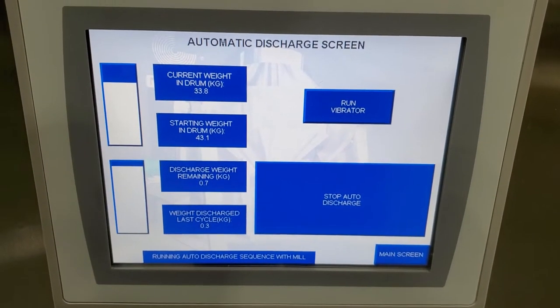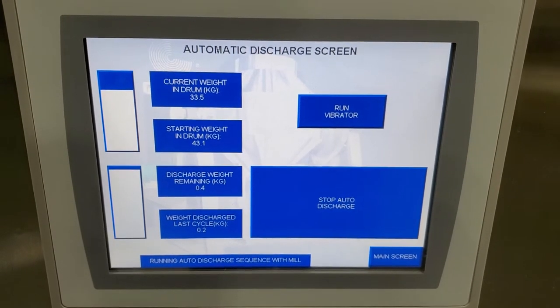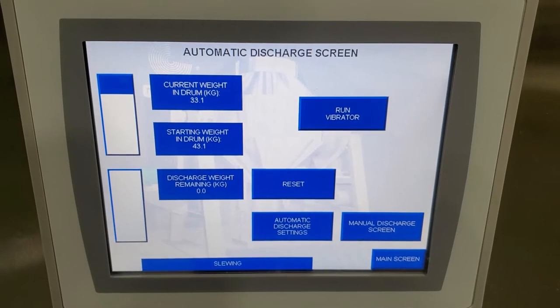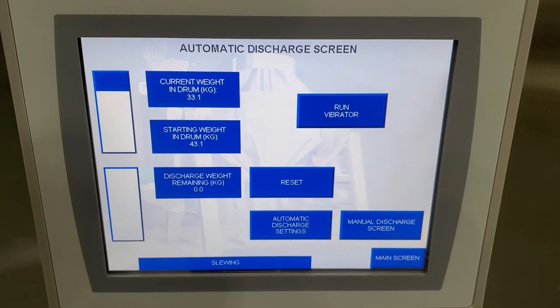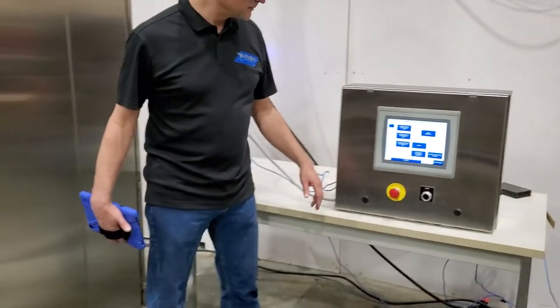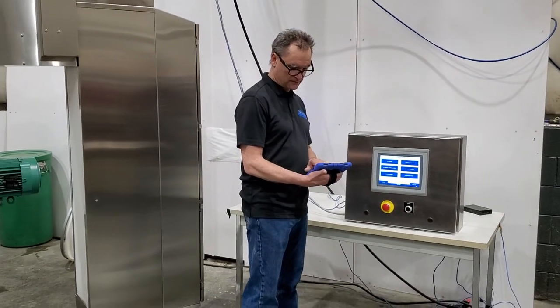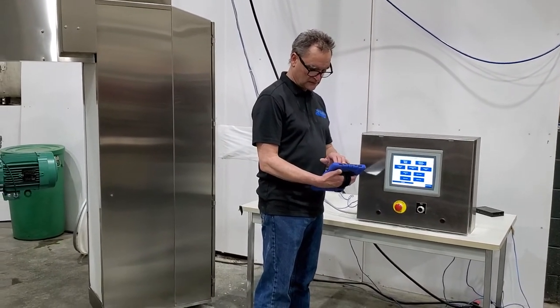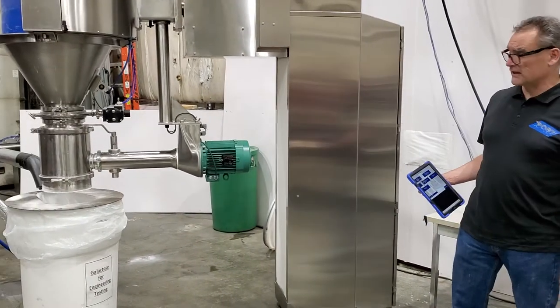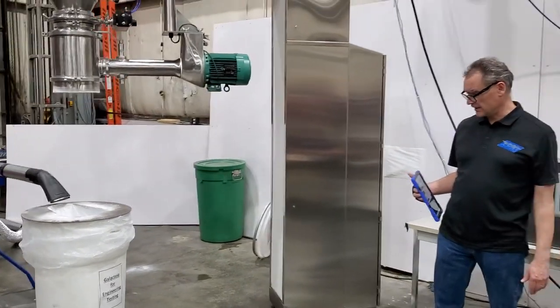0.9 kgs to go. So 33.1 — perfect. I'm going to pull the drum out. It runs the vibrator to take off any extra dust. It starts its return sequence.